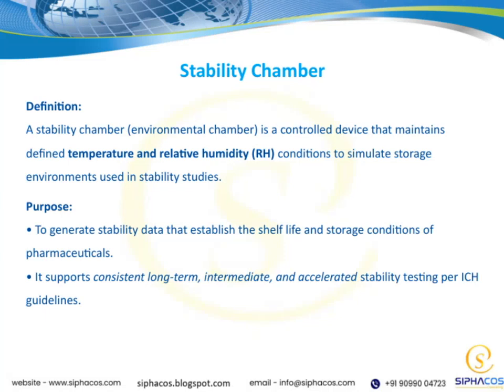Let's start by talking about what a stability chamber actually is. A stability chamber, also known as an environmental chamber, is a specially controlled device. Its main function is to maintain specific temperature and relative humidity conditions. This control allows us to simulate the storage environments that pharmaceuticals are kept in during stability studies.